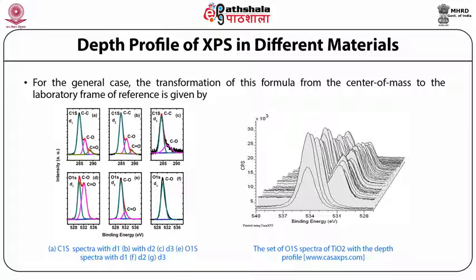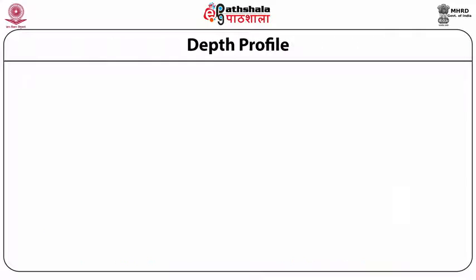A prominent increase in the intensity of O1s peak and diminishing of C-O peak is observed with further removal of oxygen from the graphene oxide surface layers towards the depth of the thickened layer.